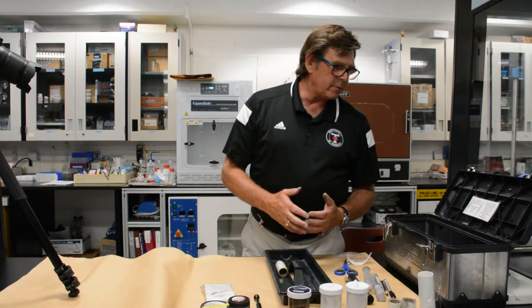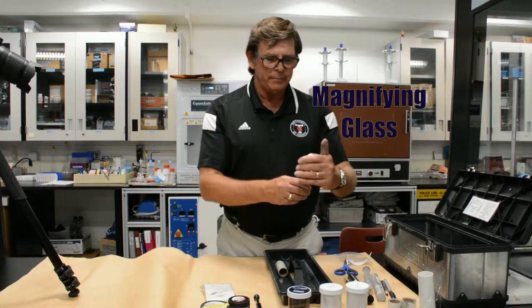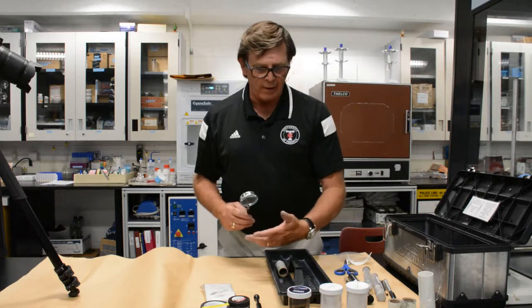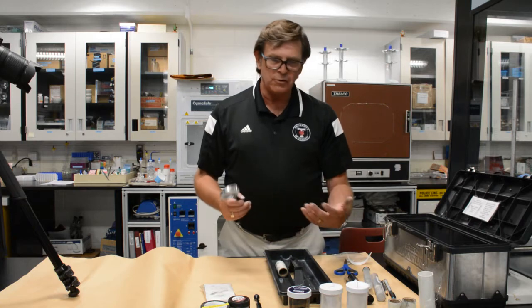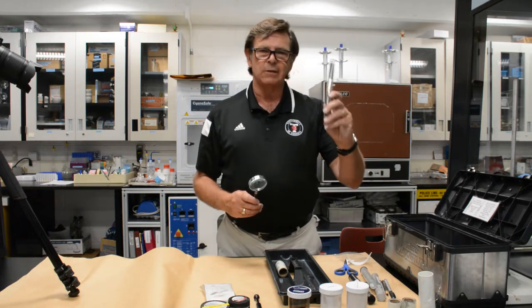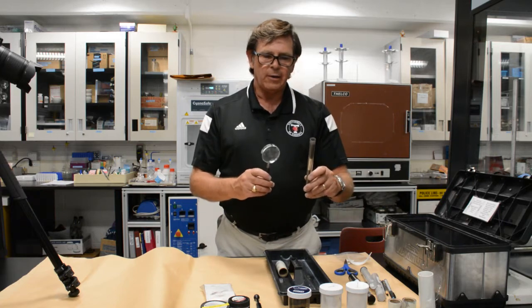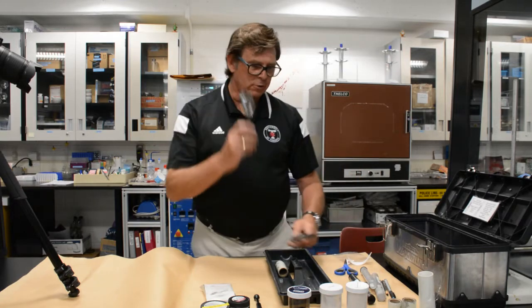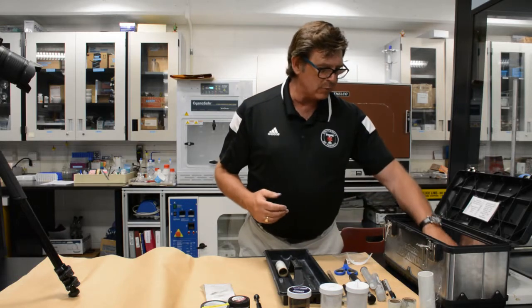So to round out the remainder of the contents of the kit, there is a magnifying glass in here. It makes you look like Sherlock Holmes when you're using it, giving you a more magnified view of the fingerprint, not only for searching for the fingerprints, but also as you're using your clean out brush to enhance the detail on the impression, to ensure that you are getting the optimum development without starting to degrade the impression. So it's just a useful tool all around for magnified views.